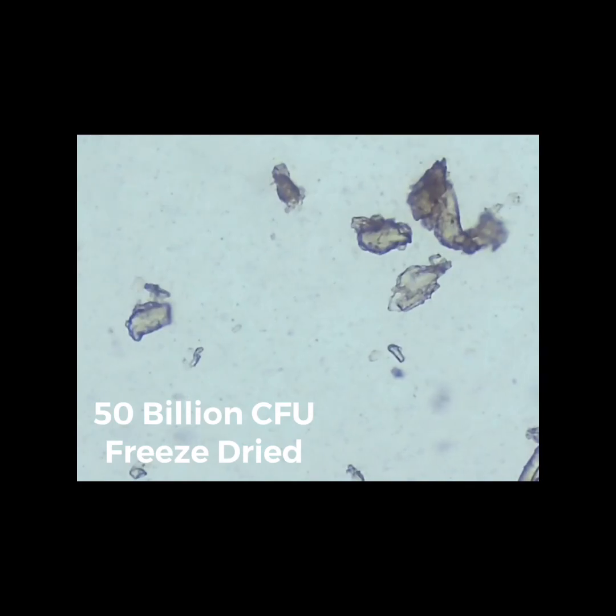Here is a 50 billion CFU probiotic with multi-strains. You see a big bunch of globs up there — those are all dead cells. You see a bunch of dirty-looking specks everywhere else — that's dirt, clay, debris. If you look, there's nothing glowing and nothing moving around except some water movement on the slide. The individual cells are not moving. There really is no sign of life with 50 billion colony-forming units, multiple strains, a top-selling product. Look under the microscope — what are you actually getting?